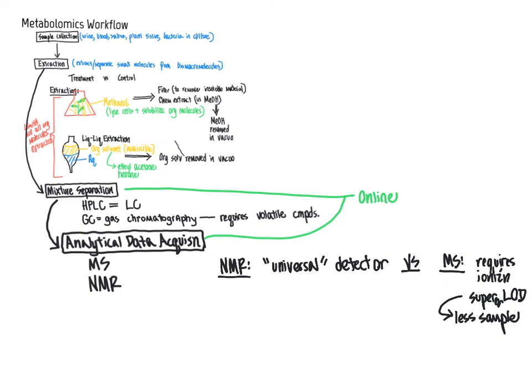And mass spectrometry can generally deal with a much smaller amount of sample because it has a very superior limit of detection, sometimes being able to detect as low as nanomolar concentrations of compounds, whereas typical NMR applications require micromolar or millimolar concentrations, hence necessitating additional amounts of sample.